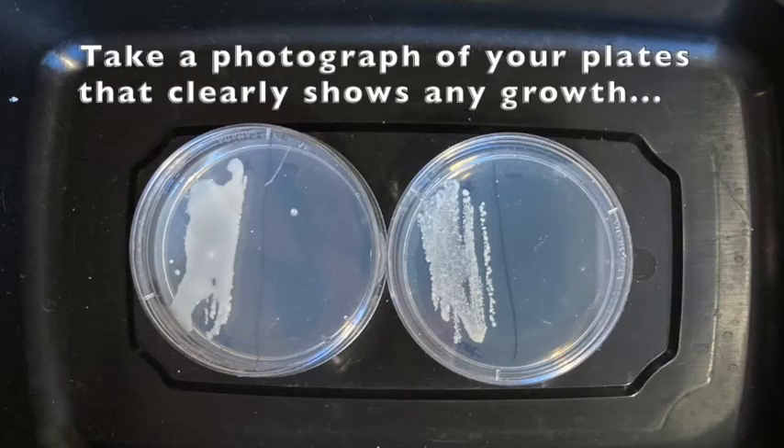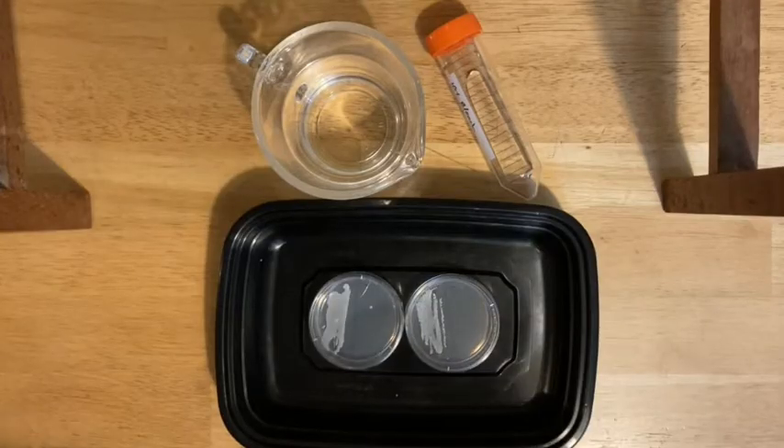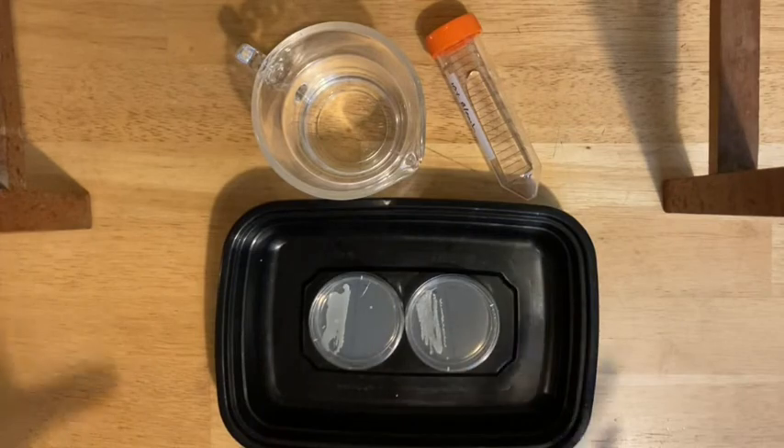Every day you should take a look at your plates and try to photograph them. As soon as you see clear growth, you're done. If you don't see growth by day three, go ahead and clean up anyways — you don't want to risk growing something gross. Once you see growth on your plates, you want to make sure you sterilize them just in case there's some other growth aside from the yeast.